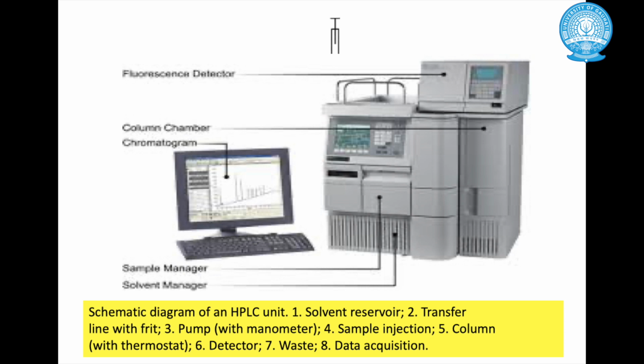So on the bottom right, what is shown is the compounds present in the sample when it enters the column, which is the stationary phase of this whole chromatography setup.